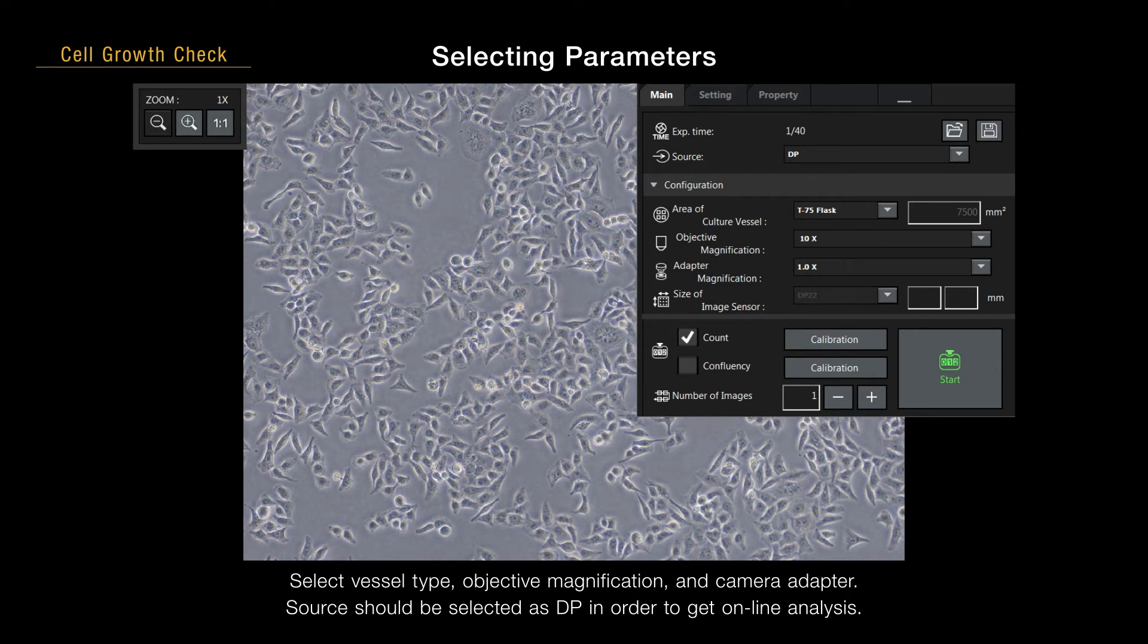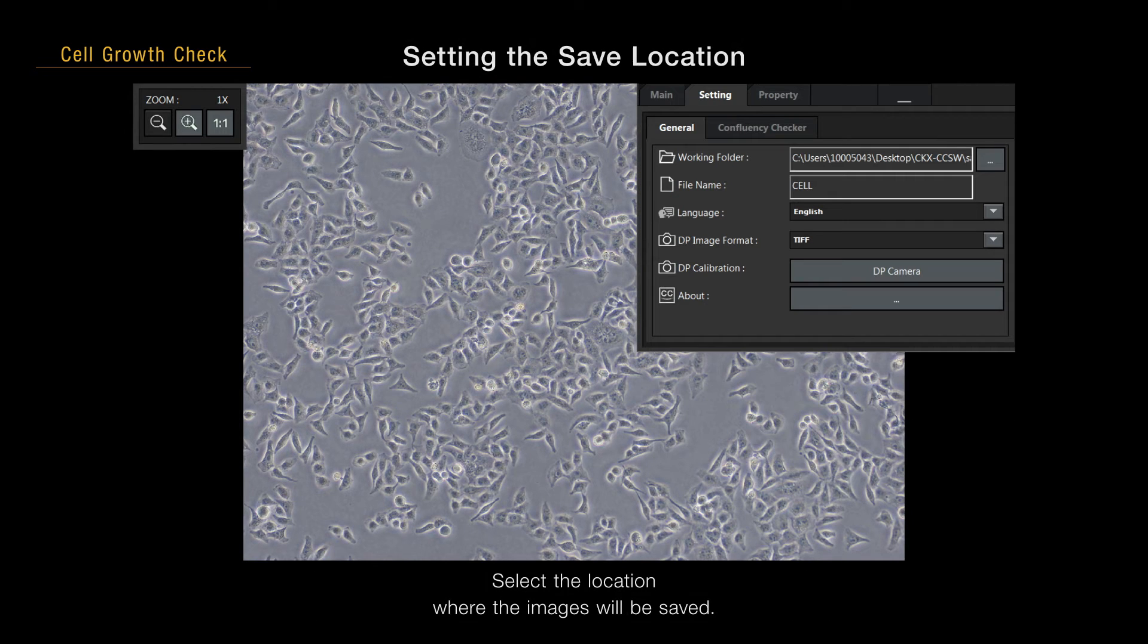Source should be selected as DP in order to get online analysis. Select the location where the images will be saved.